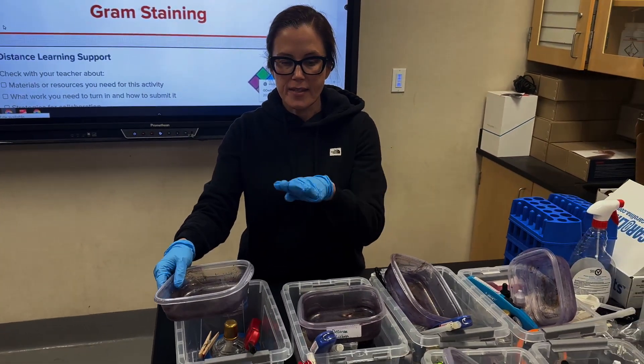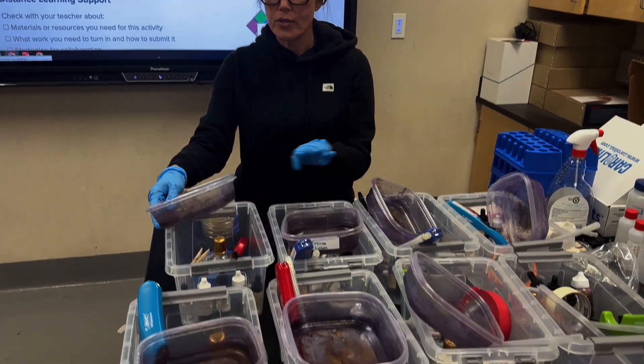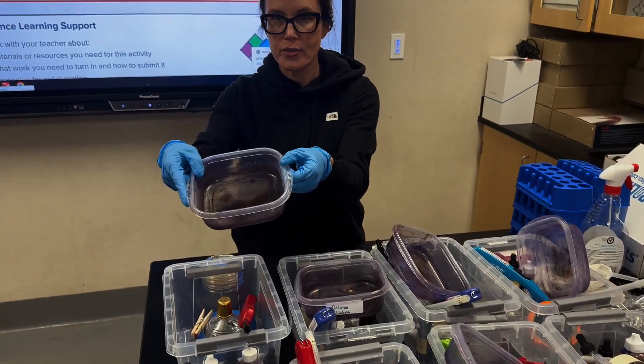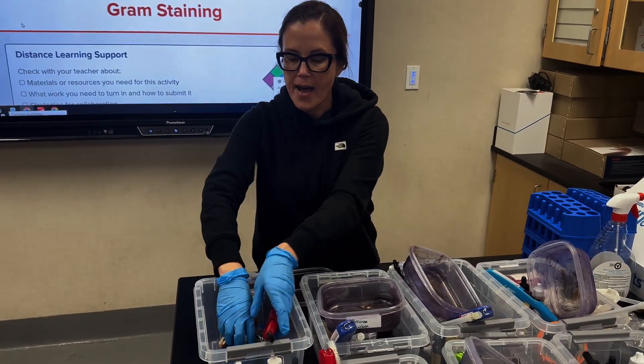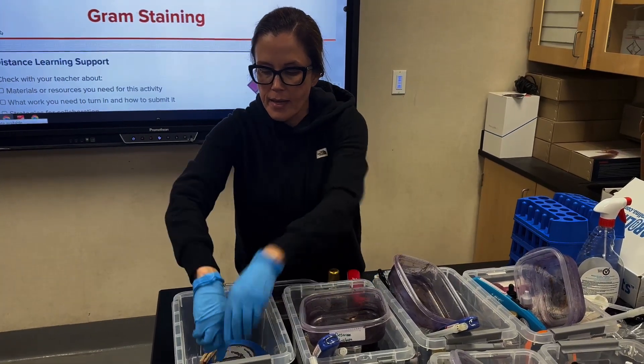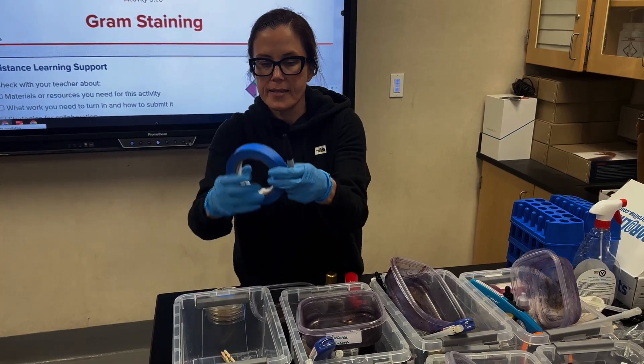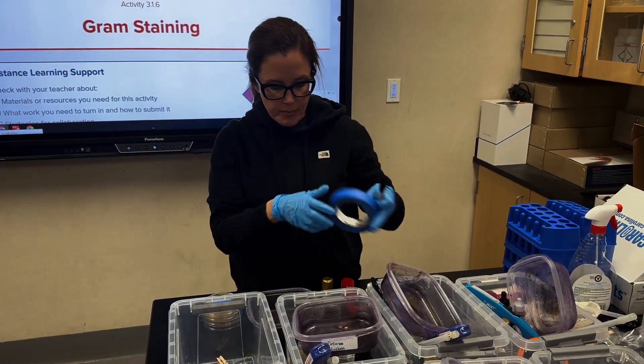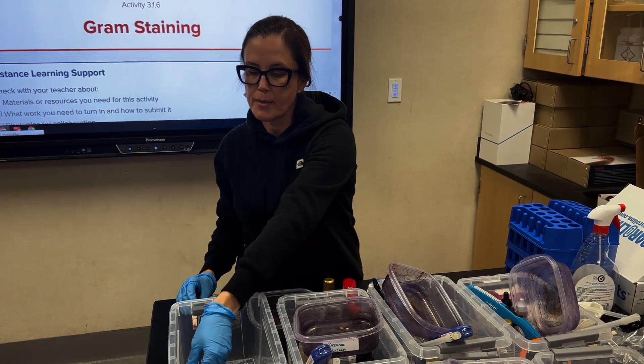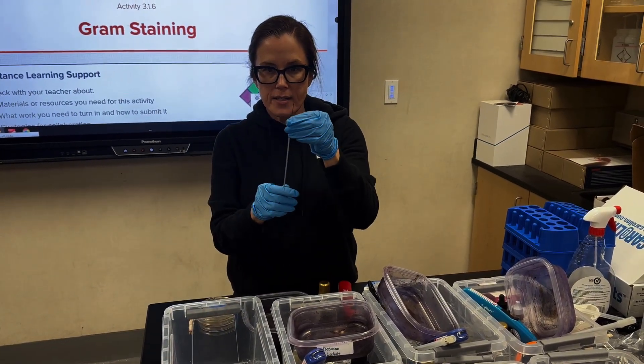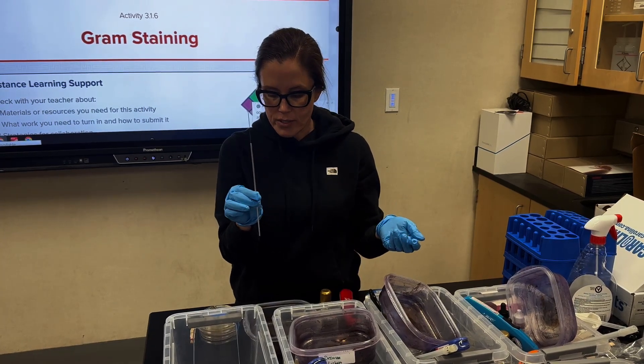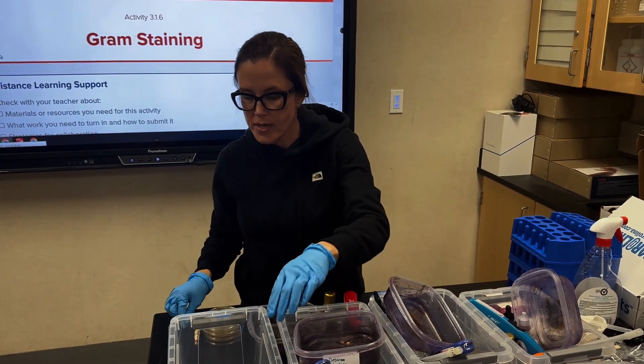In each of the student buckets I have eight lab tables with four students per table. I have a reusable dish for them to do the staining in. I have an alcohol lamp and a lighter. I've given the students a tape and marker for labeling their samples. We have a clothespin for the staining process as an inoculating loop reusable metal one. You can also provide your students with the disposable plastic ones.